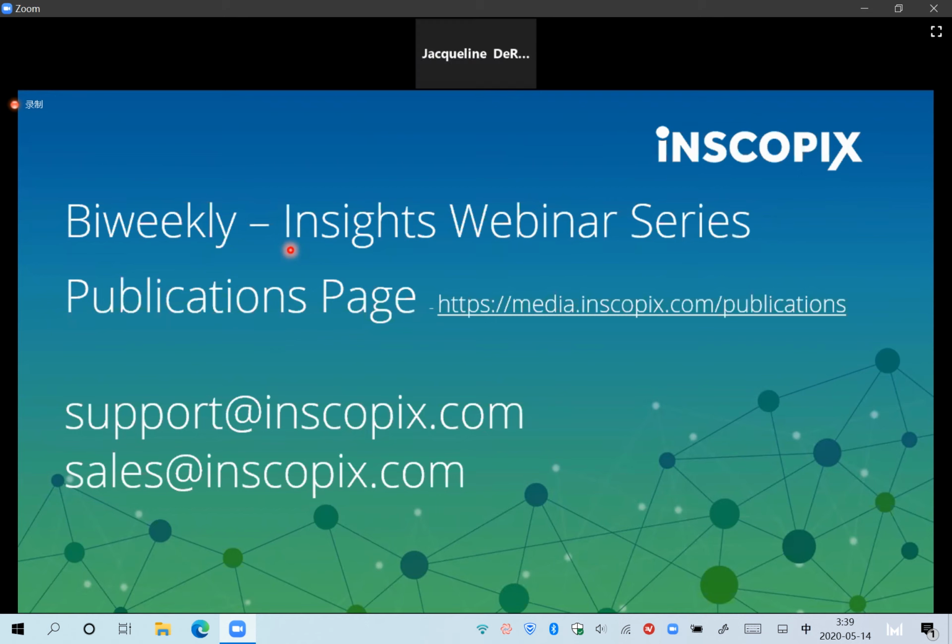Thank you, Adani. I was also going to ask about the integrated lenses. Most scientists likely have their own research interests in a very particular brain region or field of study. These lenses are actually offered for all lengths, correct?